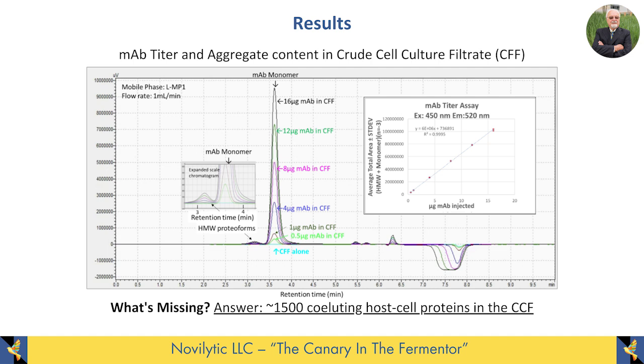But you don't get any band spreading because the speed with which the big molecule goes through is not affected by the binding of the little molecule. And this is a blow up here that you can see the dimer here. There are multiple forms of it that increases, and you can't see any tetramer at all.